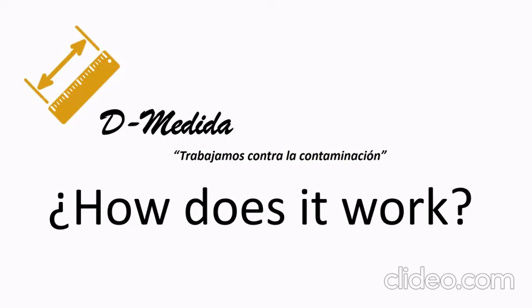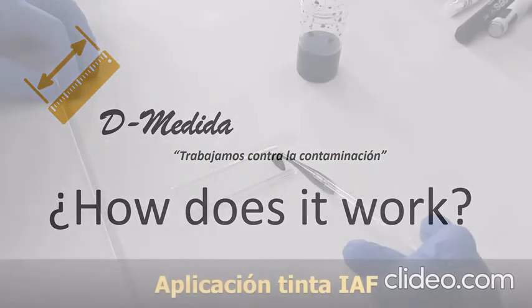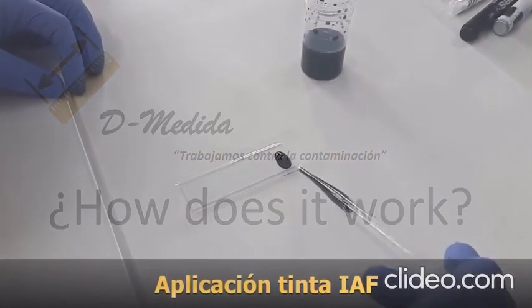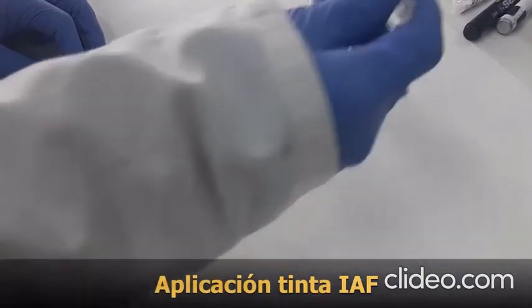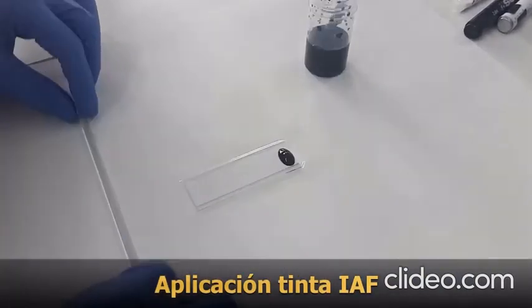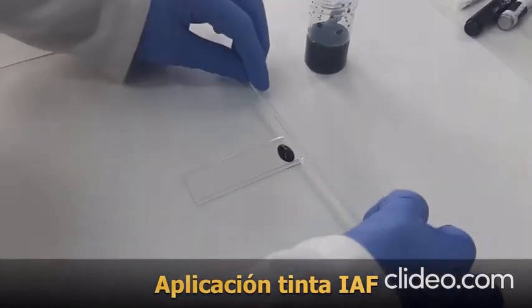How does it work? In this video, you can see how this type of equipment works. The first step is the application of the ink onto the photocatalytic surface. In this case, the surface analyzed is a white paint.